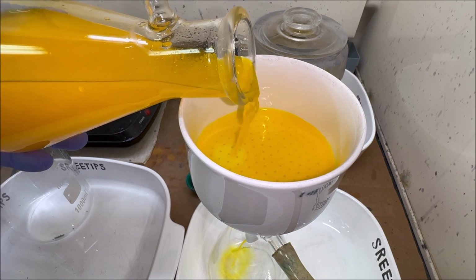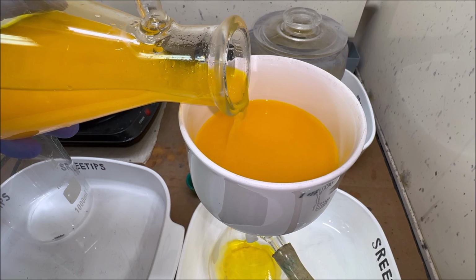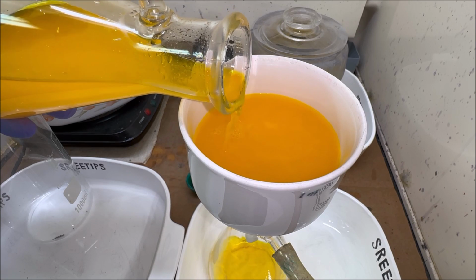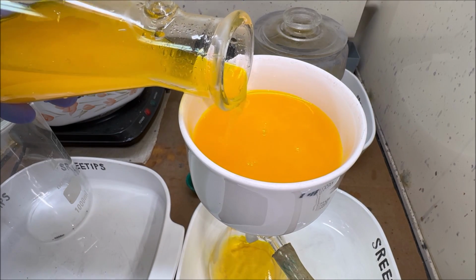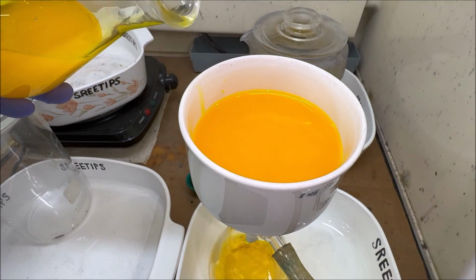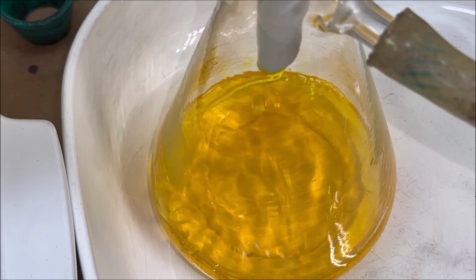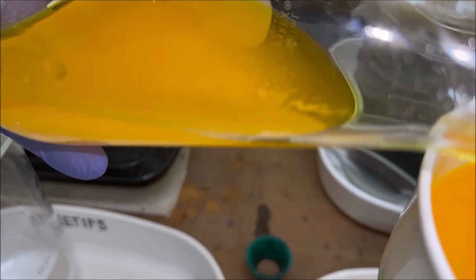And the reason that we add sulfuric acid to our gold solution, and supposedly what I've been taught, is that sulfuric acid will cause lead sulfate to precipitate out. The lead sulfate is insoluble, and so now we should be able to filter it out 100%. Oh yeah, I can see it in there. It's pulling through the filter very quickly, which is good. And if you look up in here, you can see there's some precipitate in that flask.